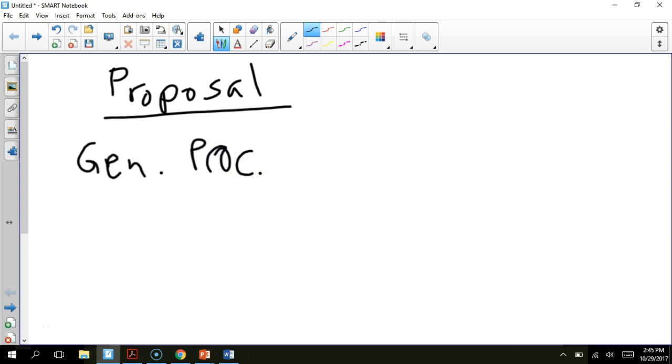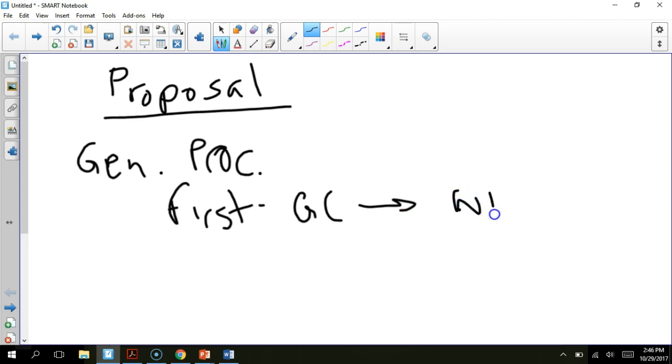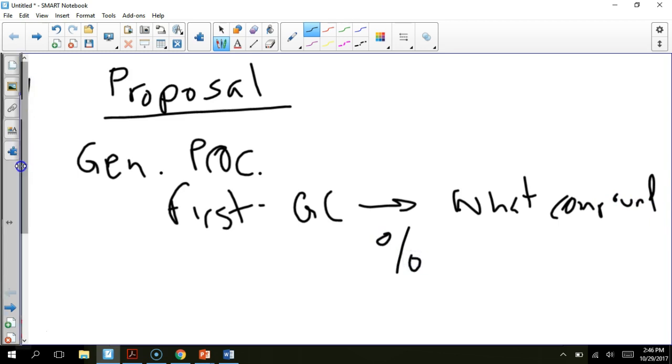Okay, so first, you're going to do GC. I don't know, I'm making that up. You may not do GC. But first, you're going to do GC, and GC is going to tell you what compound it is, and then you're going to be able to determine what percentage it is.